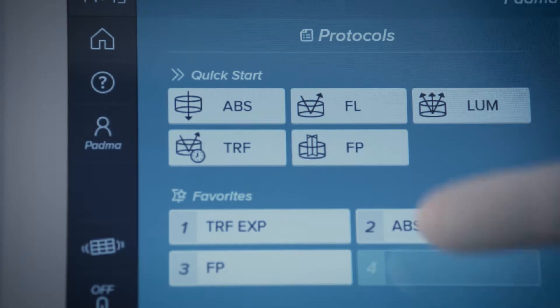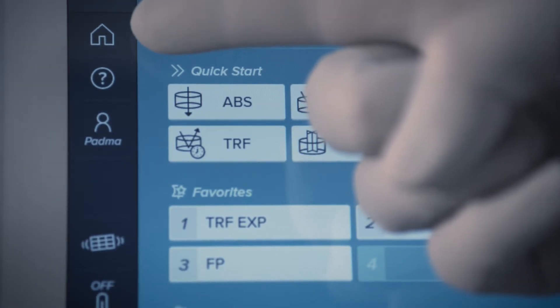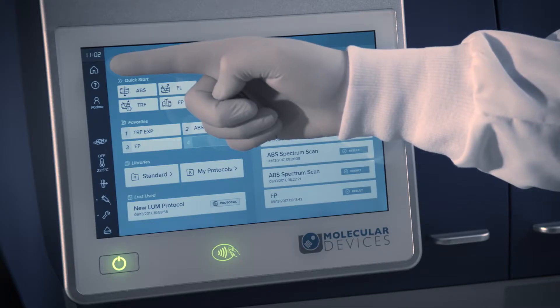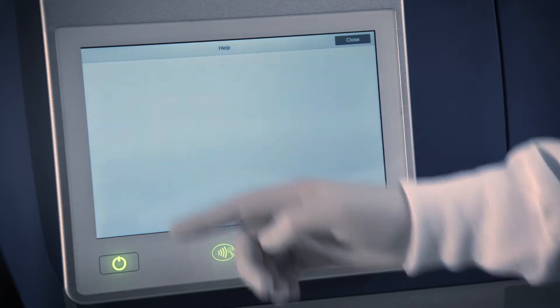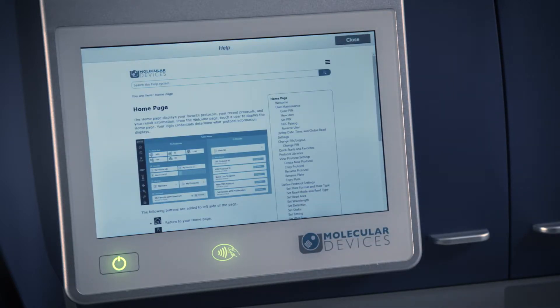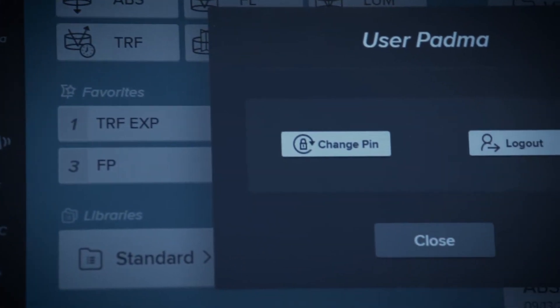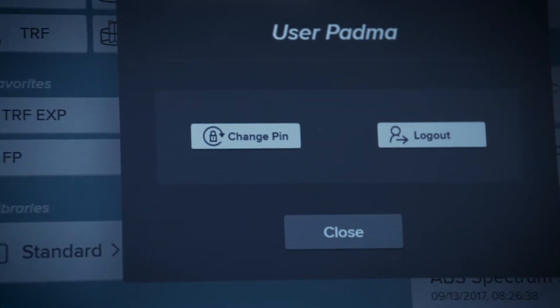In the upper left-hand corner under the clock, you can find the home icon that returns you to the home page. Directly underneath the home icon is a help icon which can provide you with page-specific and searchable application help. The user icon identifies a user logged in and provides options to change the login pin and log out.